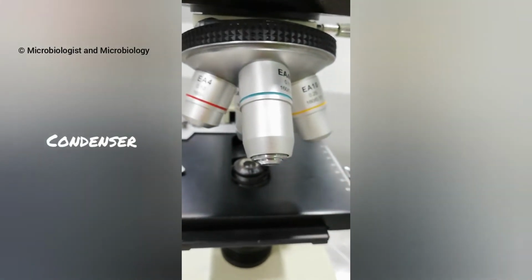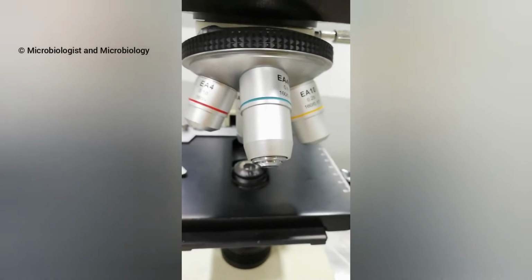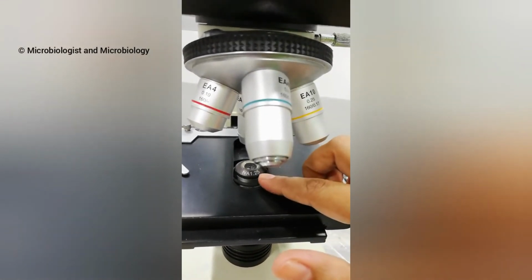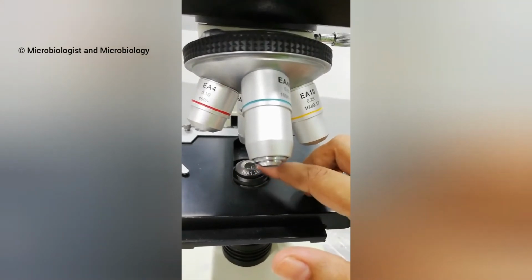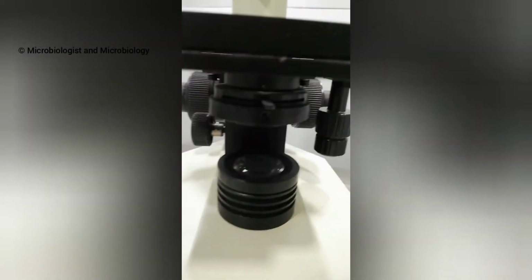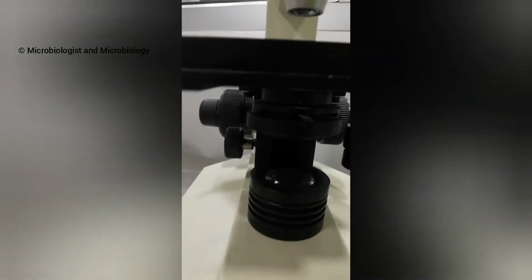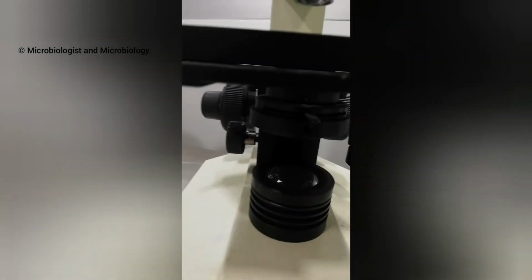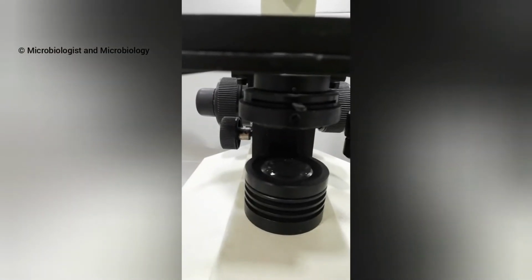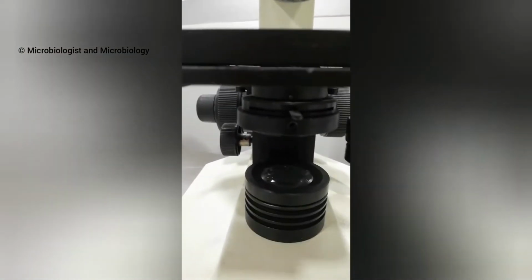So if we look underneath the stage, you see the condenser is up here. The condenser can be controlled and moved up and down, but for most applications all the way to the top is the best position. On the condenser there is a small lever. This is the iris diaphragm lever, and it controls the amount of light that passes through the condenser. The light intensity can be controlled directly below the condenser. On the front of the microscope there is a switch which will turn on the light.